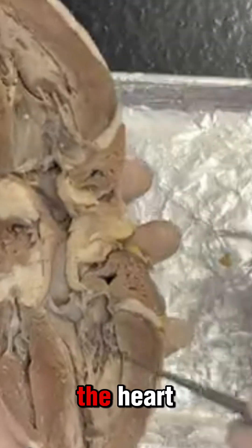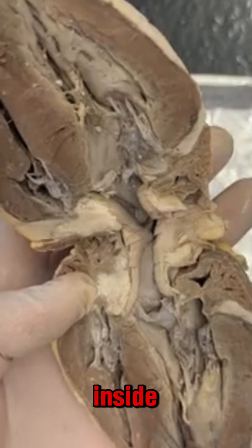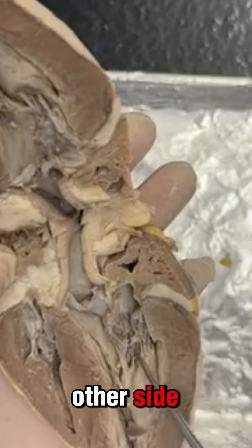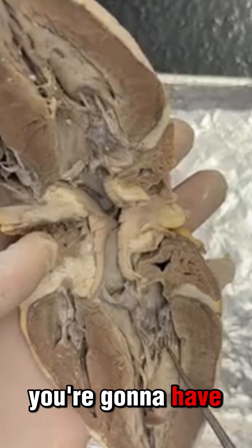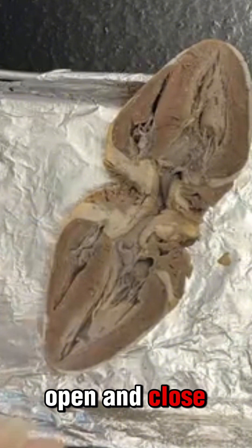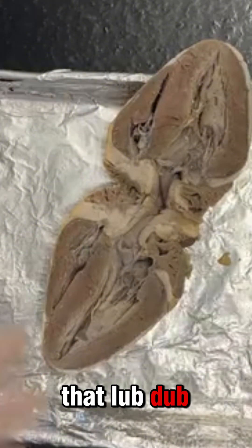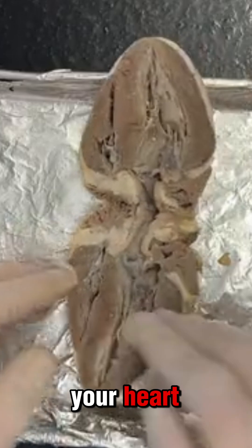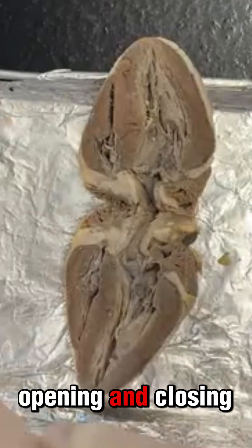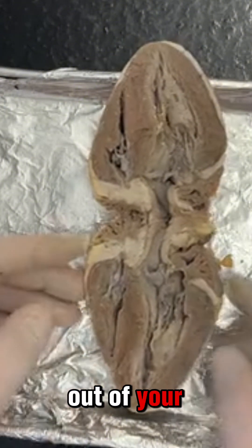Some other things about the heart: you have some valves on the inside. This is going to be your tricuspid valve, and then on the other side — the left side of the heart — you're going to have your bicuspid valve. These are going to be trap doors that open and close. So when you feel your heart beating or you hear that lub-dub sound, it's the tricuspid and bicuspid valves that are opening and closing and letting blood flow in and out of your heart.